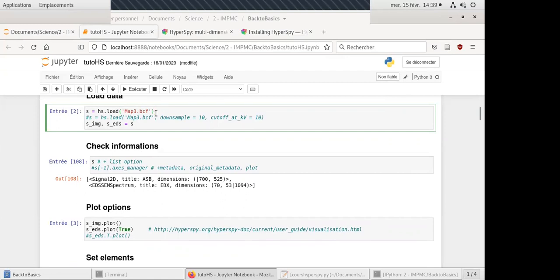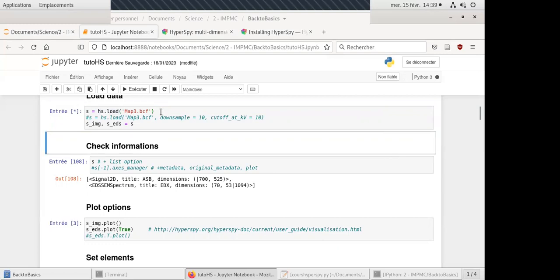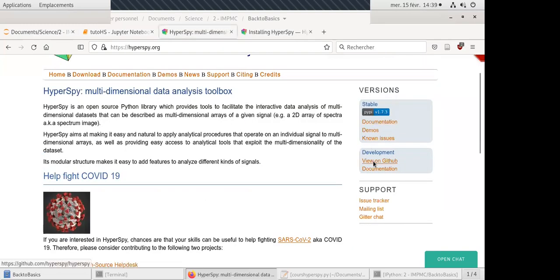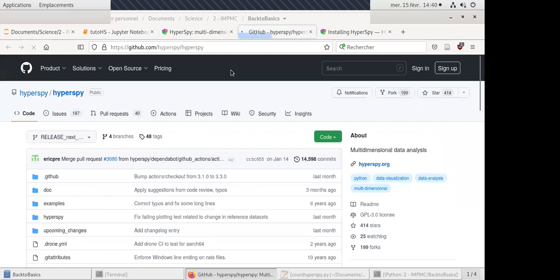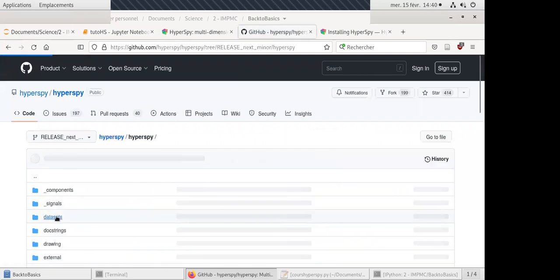Here I'm loading a BCF file — a Bruker dataset. To load it, I use the HyperSpy load function and put in the filename. The BCF file is a binary proprietary format, so you can't open it without proprietary software unless you use HyperSpy. HyperSpy is also implemented by a community working on GitHub.